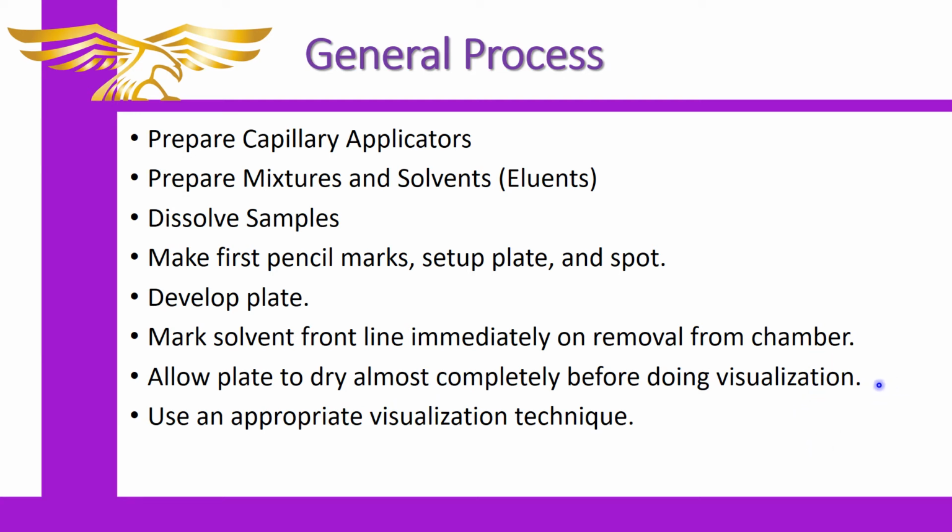This is an important step, because if you don't let the plate dry and let the solvent evaporate off of it, you can have some errant results when you view the plate. Something may not show up correctly, it might be hidden by residual solvent, or in some cases you will actually register some kind of a different movement. It's just better that you let it dry, and it doesn't take long to do this.